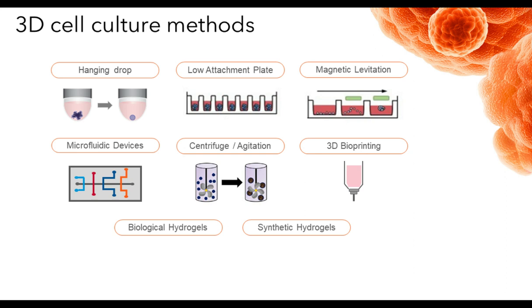But increasingly, there are other techniques coming in: the use of microfluidics, the use of 3D bioprinting, and also the growing of cells on biological hydrogels as well as synthetic hydrogels.